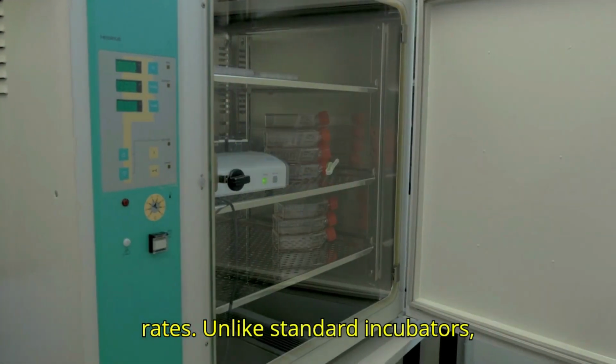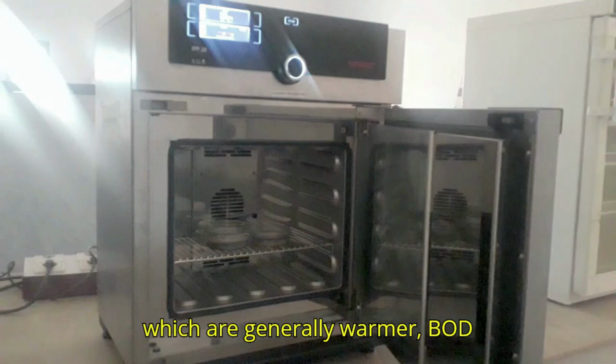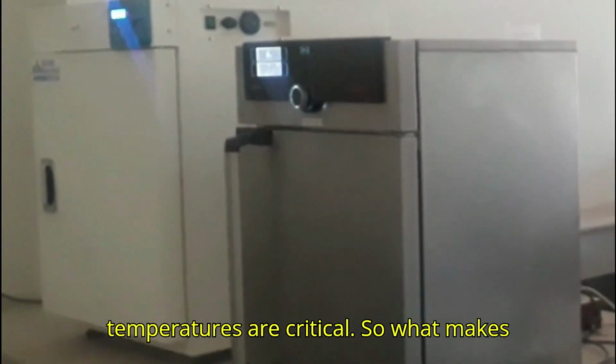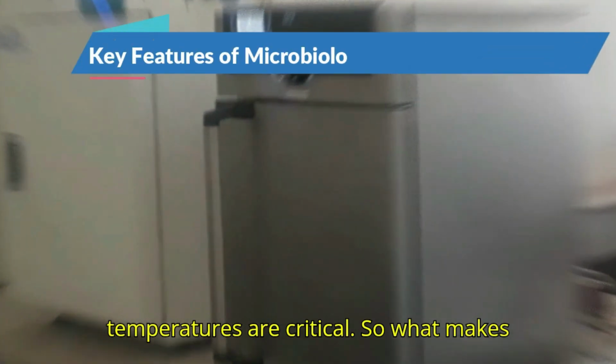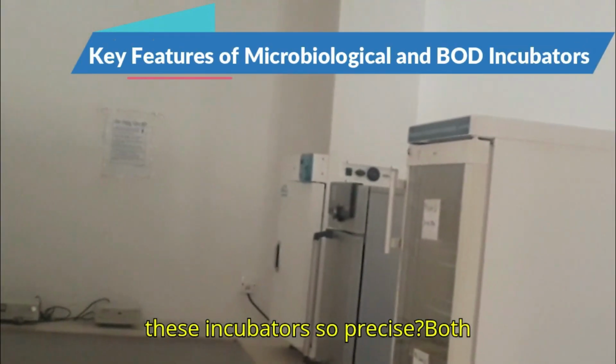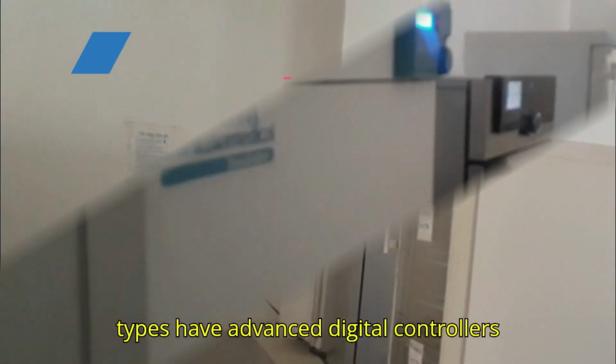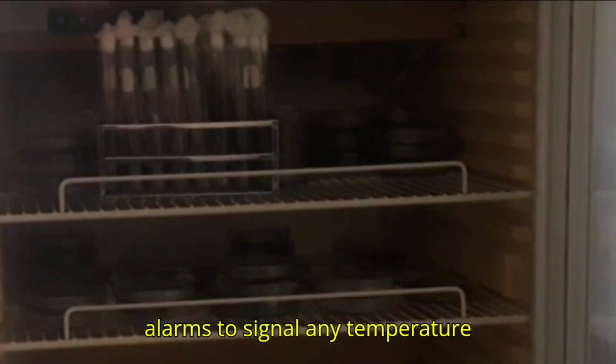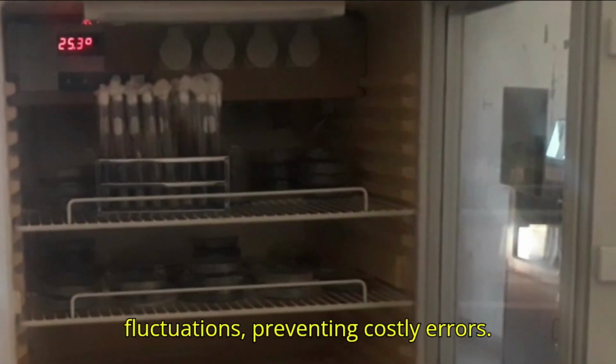Unlike standard incubators, which are generally warmer, BOD incubators are often used for long-term experiments where stable, cool temperatures are critical. So, what makes these incubators so precise? Both types have advanced digital controllers that allow researchers to set specific temperatures. Many models also come with alarms to signal any temperature fluctuations, preventing costly errors.